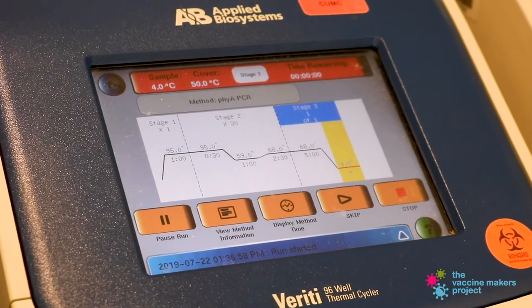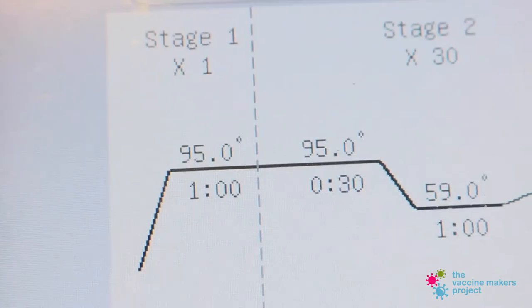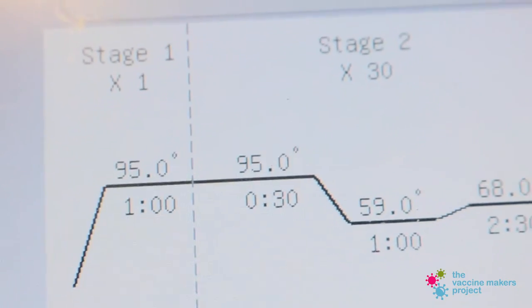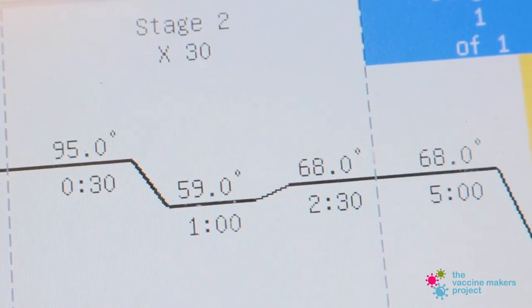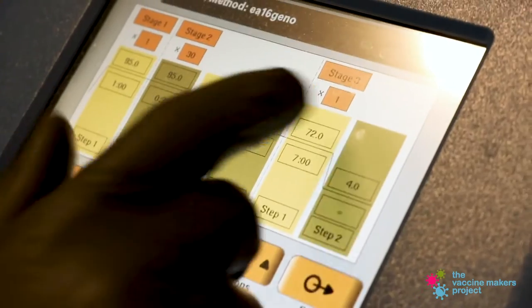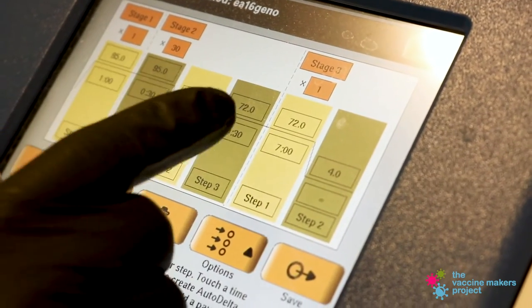The most basic function of a PCR machine or thermocycler is to rapidly raise and lower the temperatures of your sample tubes to allow the polymerase chain reaction to take place.